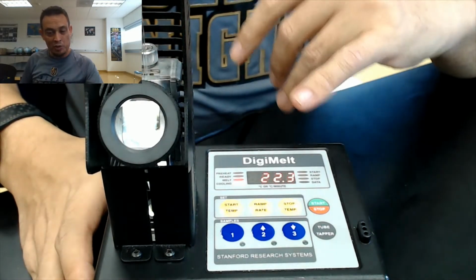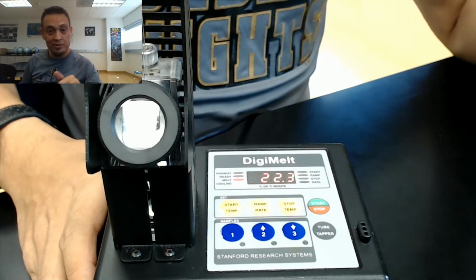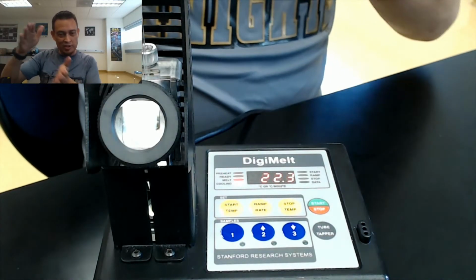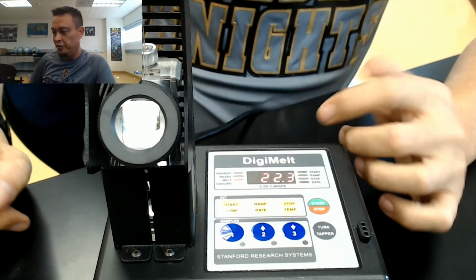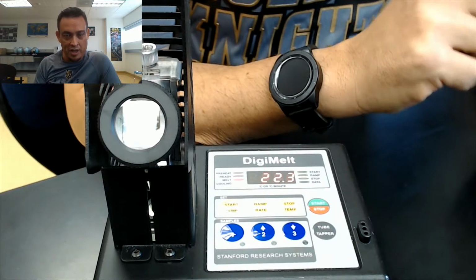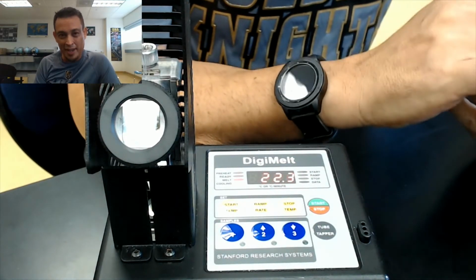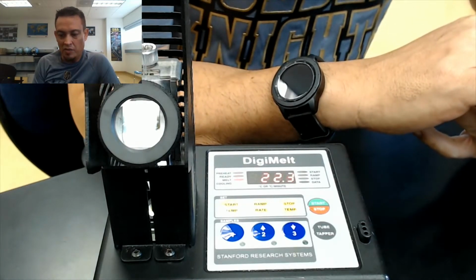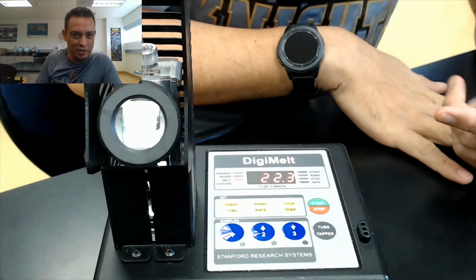So for the programmable ones, what you want to do is you want to set a start temperature, a stop temperature. That's basically the range at which the instrument's going to run. And then you need to set a ramp rate. So I recommend that you go with about 15 to 20 degrees below what you expect the melting point to be. And then just somewhere above it, doesn't really matter how far above, I usually go about 10 degrees over.